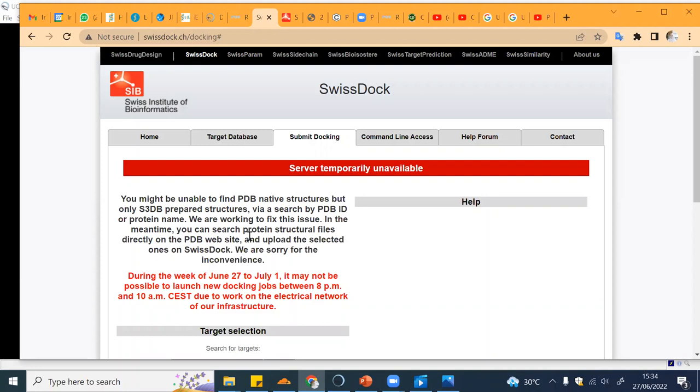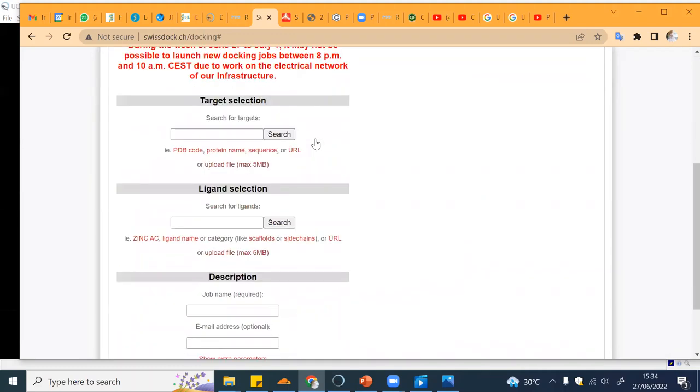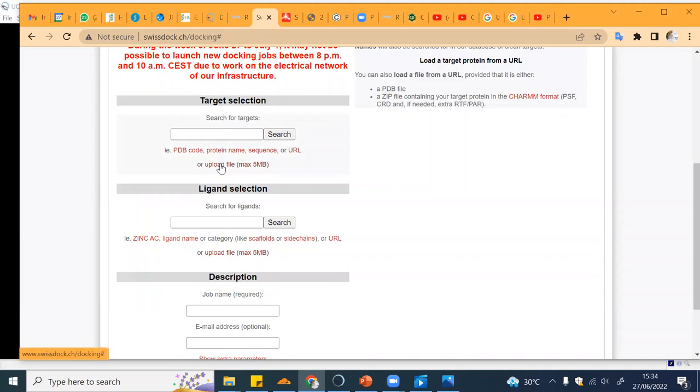It's very easy. You can just go to SwissDock and then click the Submit Docking tab. What you can do is just upload your file - this is the file that you already prepared for the target.